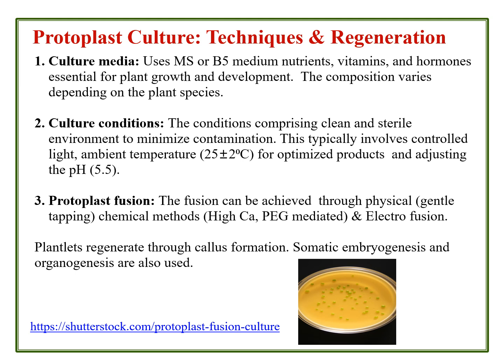The polyethylene glycol method is the most preferred or prioritized method, where there are fewer chances of contamination and shock to the protoplast, whereas in electrofusion there is a thermal shock whenever the kinetic energy is accidentally increased by chance. Since protoplasts are very sensitive, they may get the shock, so that the junctions between the two protoplasts will be damaged. So that is the problem with electrofusion.